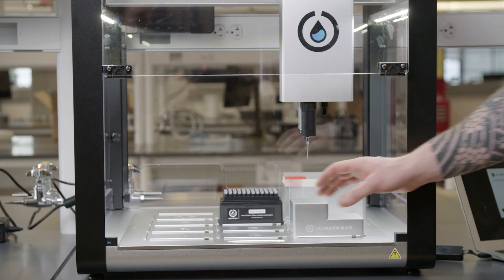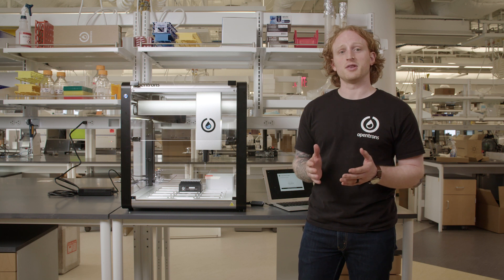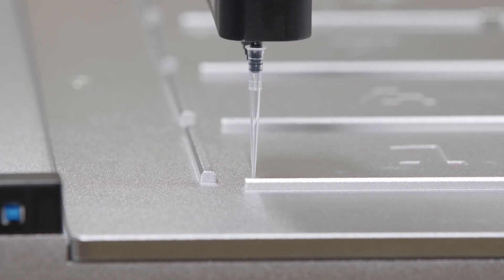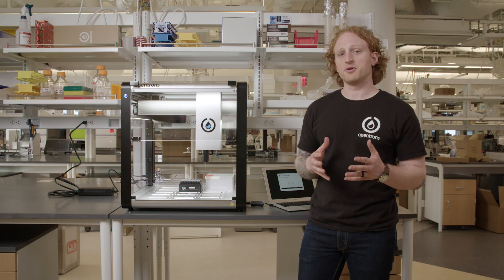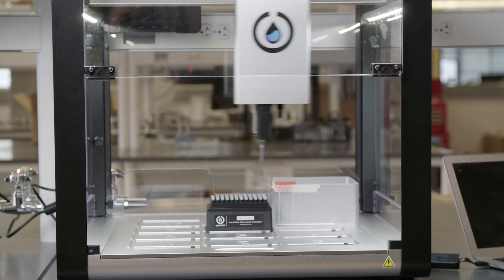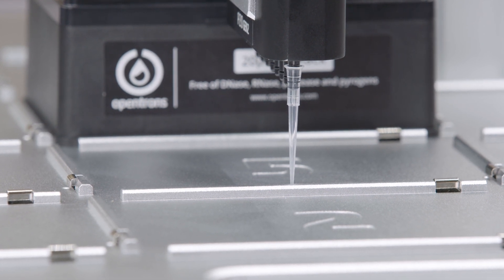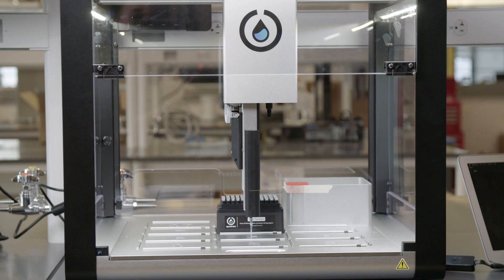I will remove the calibration block to continue with the pipette offset calibration. Pipette offset calibration compensates for the distance between the two pipettes based on the manufacturing variation of the OT2 and pipettes. Each pipette has its own pipette offset that I need to calibrate to ensure the highest accuracy. The OT2 already has a tip attached, so it will use that for the calibration process. The pipette will now go through a similar process to the deck calibration, first moving to slot 5 to measure the Z-axis. I'll jog it so the pipette is less than 0.1 millimeters from the deck, then save this calibration and the pipette will move to the cross in slot 1.